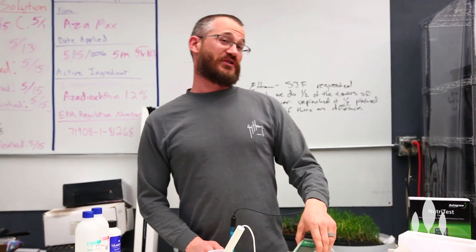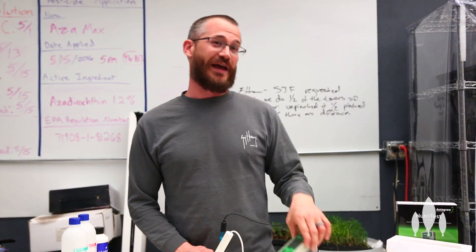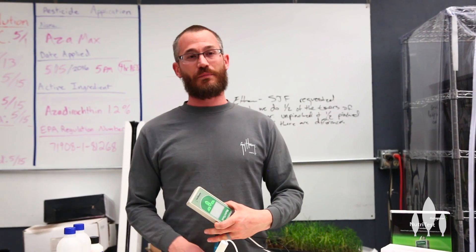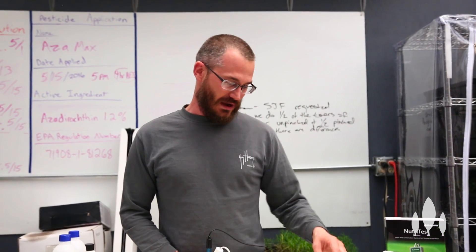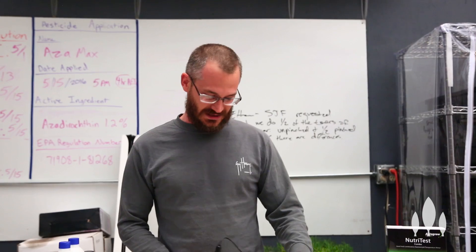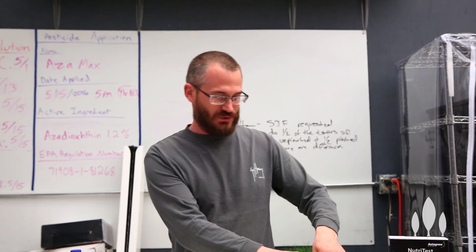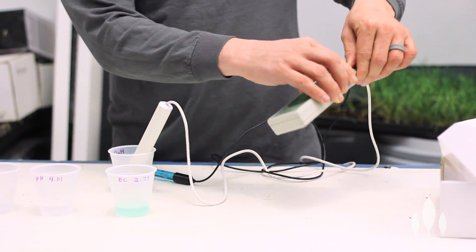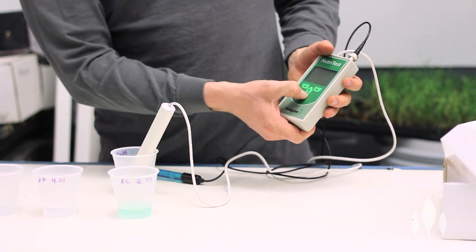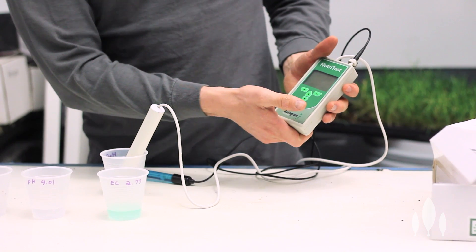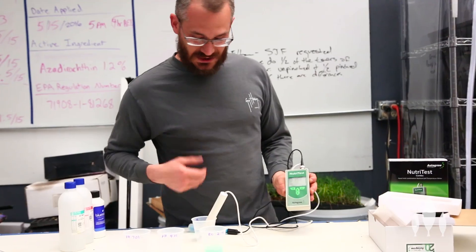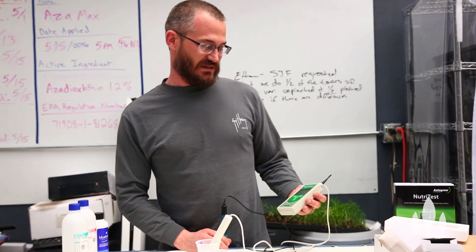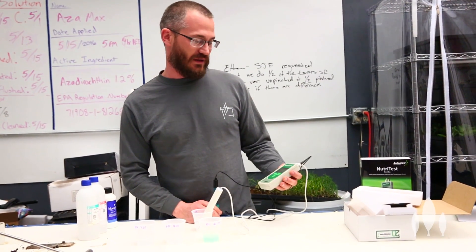So, earlier when I started shooting this video, I was informed that I was doing it wrong and we need to calibrate the thing. So I'm going to walk you guys through calibration. Basically, this just came right out of the box, right? I just screwed on the pH probe here. The pH probe just goes right on, just like that. Simple little deal. And then you turn the sucker on. And it turns on pretty easily. When you guys get it out of the box, it takes a little time to boot up.